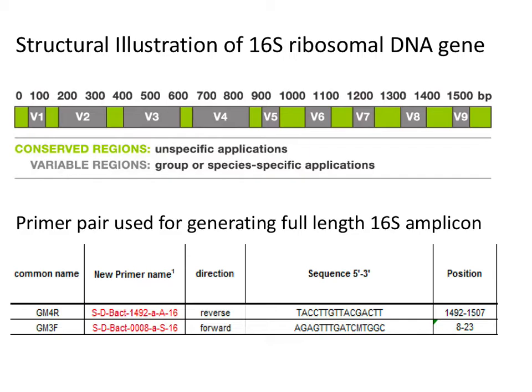You get 60-70% of your reads going to unclassified. It's not because it's truly unclassified, it's just because, for the technology you have, you're not able to do it. So doing the whole 16S, in fact, people are doing 16S and 23S all in one tandem on the Nanopore. I did just the 1500 base pair fragment and looked at the data between what you get with short read and what you get with doing the whole 16S gene.